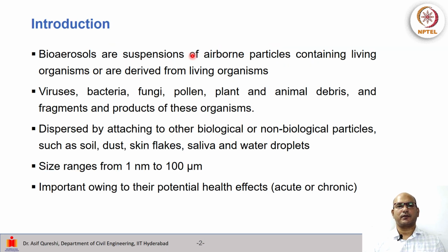So, introduction I will give, although we have seen this, that bioaerosols are suspensions of airborne particles that contain living organisms or are derived from living organisms. So these could be what? These could be viruses, bacteria, fungi, pollen, plant and animal debris, and fragments and products of these.